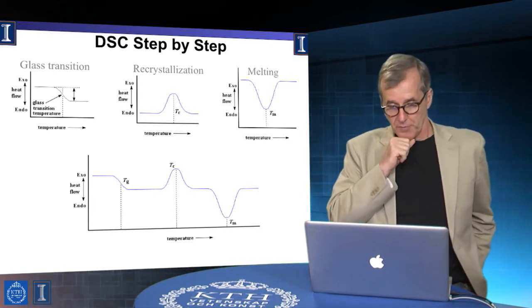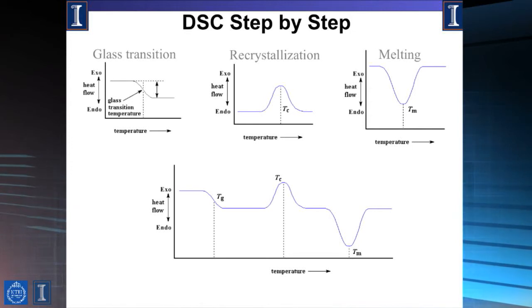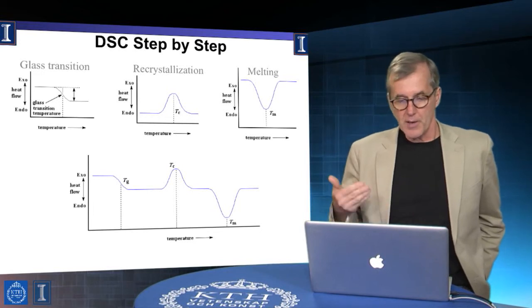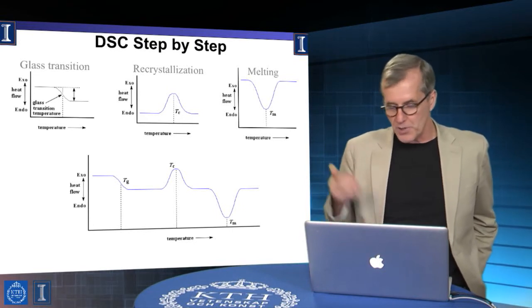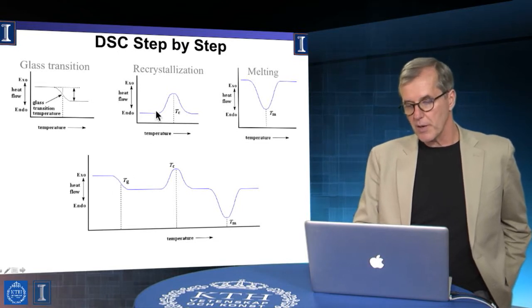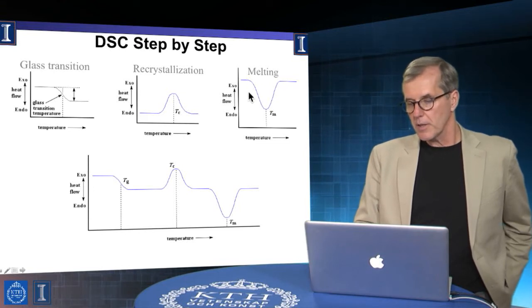And we go back to the earlier example from the previous lecture. And basically, we see exactly the same sort of thing, but with a little bit of difference, right? So we see exo and endothermic processes, and they go one direction or another depending upon the convention by which you've set up your instrument. All exothermic processes go in one direction, endo in the other, and of course we went through and described how this corresponded to the glass transition shown down here, the crystallization temperature, where the amorphous region is accreted into crystal, and the melting point.